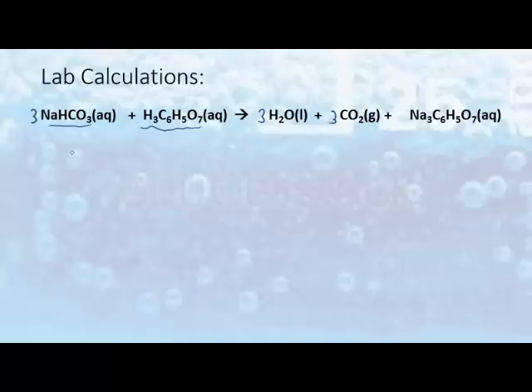The key measurement in this reaction, which we said at the beginning, is the delta mass, the change in the mass from beginning to end of the reaction. And the change in mass is actually the carbon dioxide, because everything else stays. It doesn't matter that they reacted. The only thing that matters is if something leaves. And so what happens is the CO2 has left. And because it's left, that mass has gone away. So the change in mass is equal to the grams of CO2.